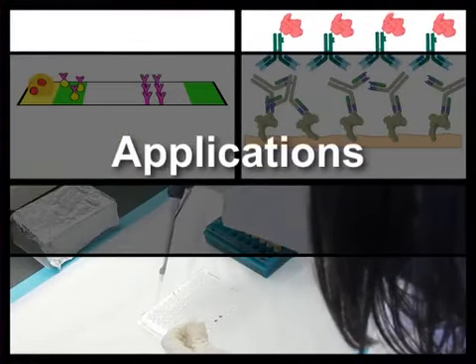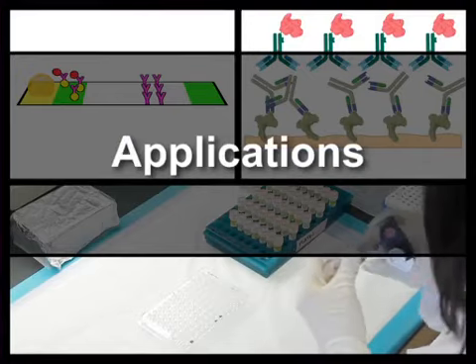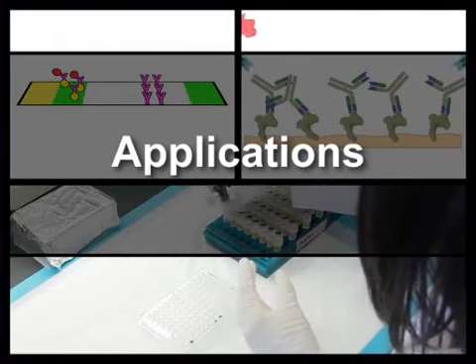So, why might you perform an ELISA? Let's take a look at a few common applications.